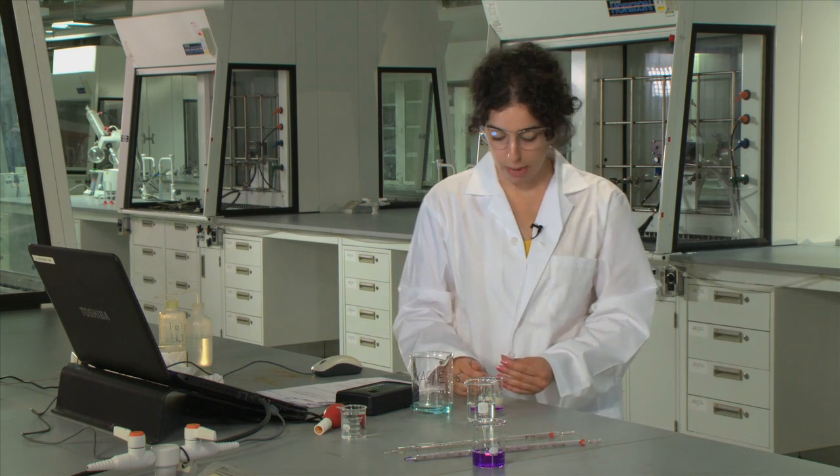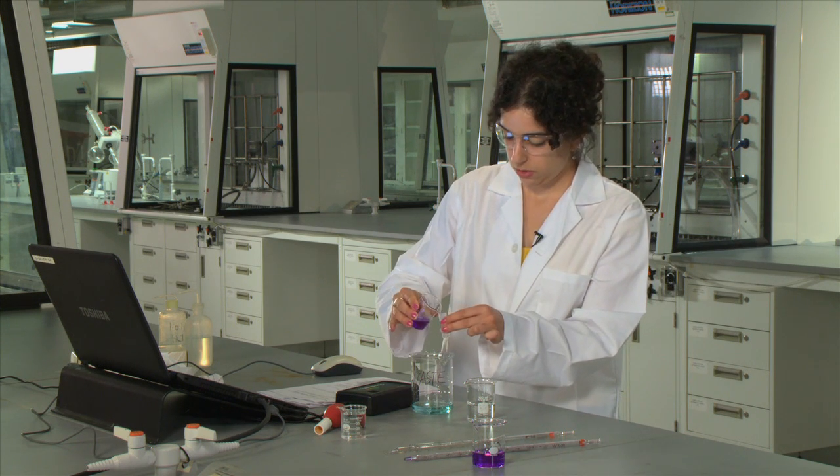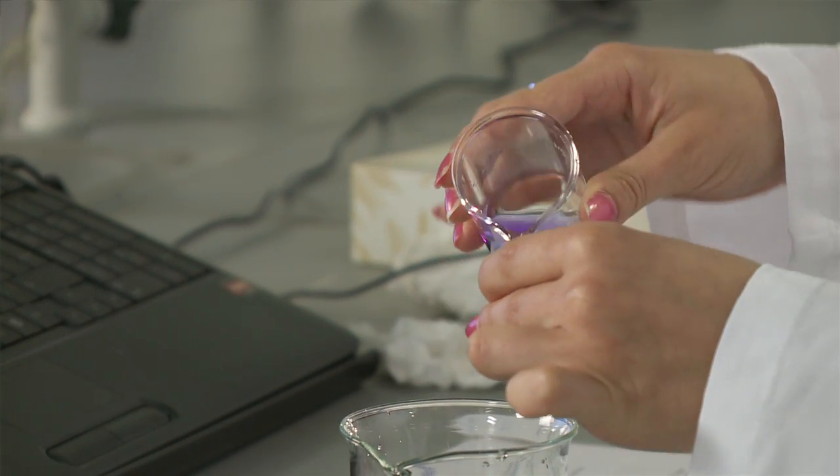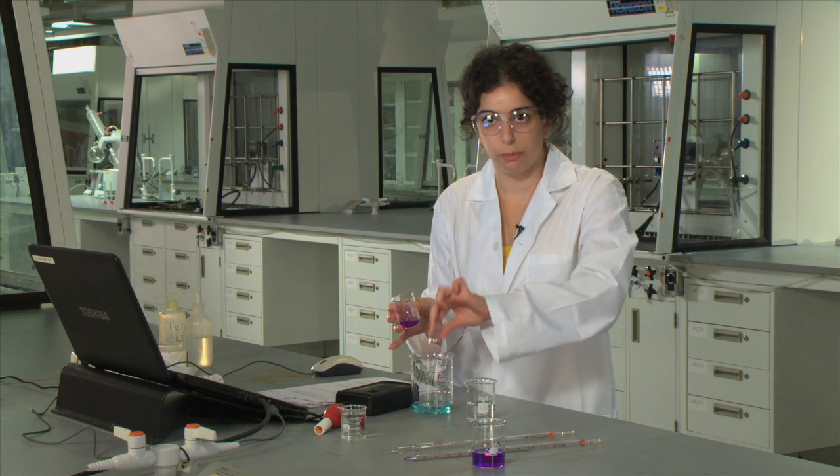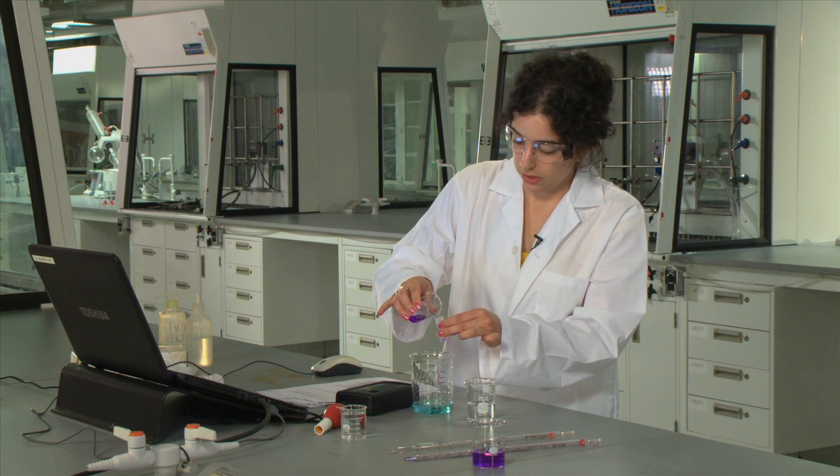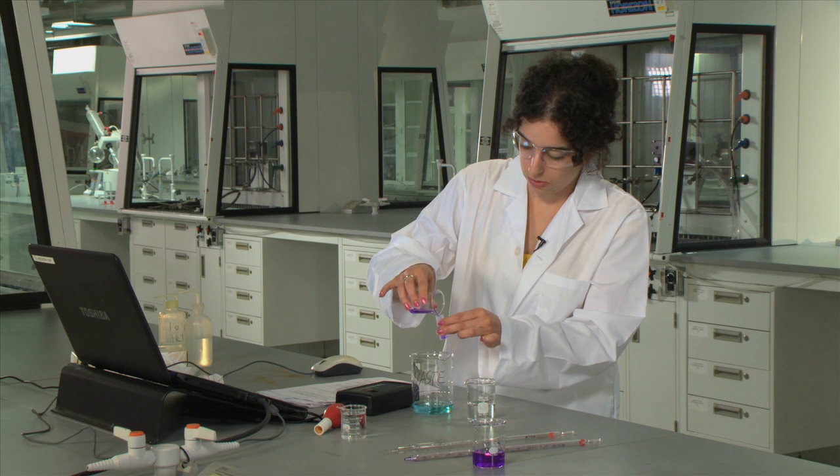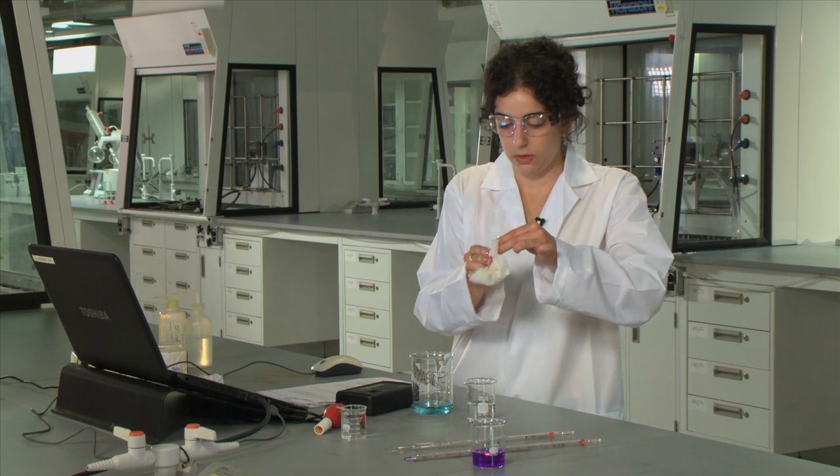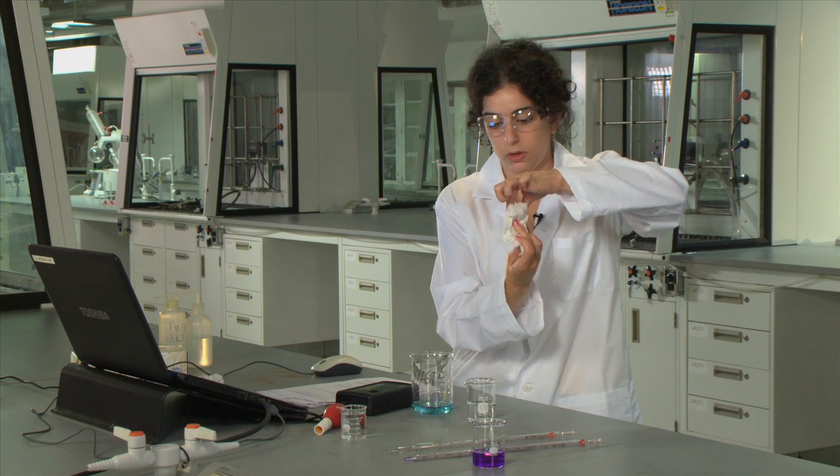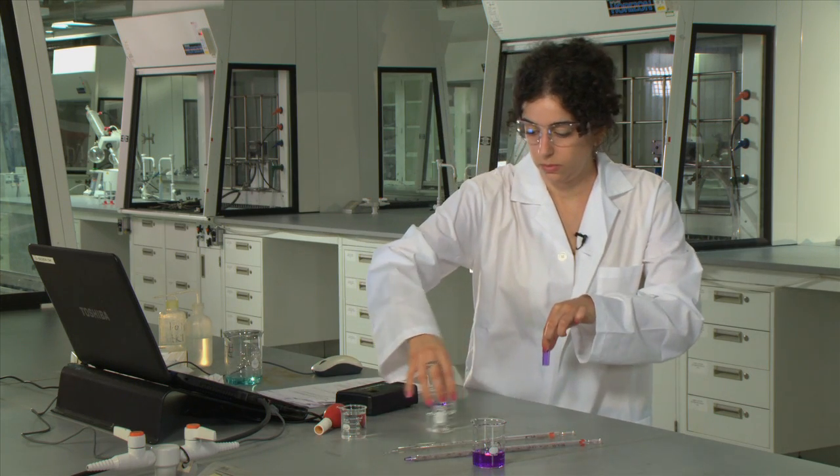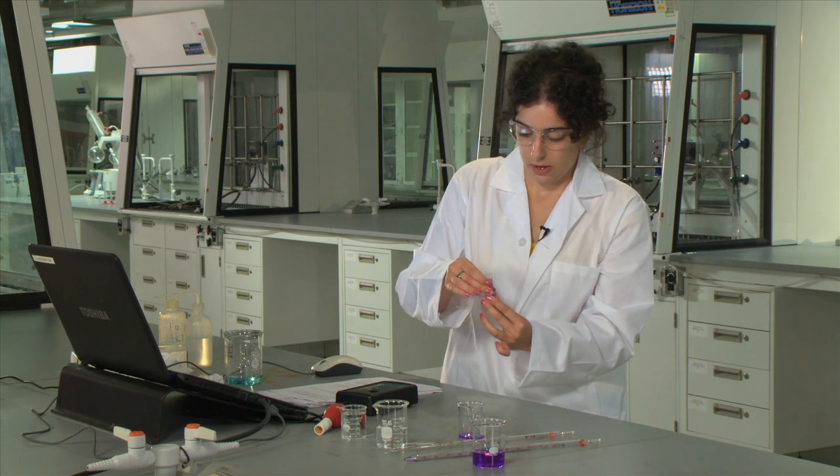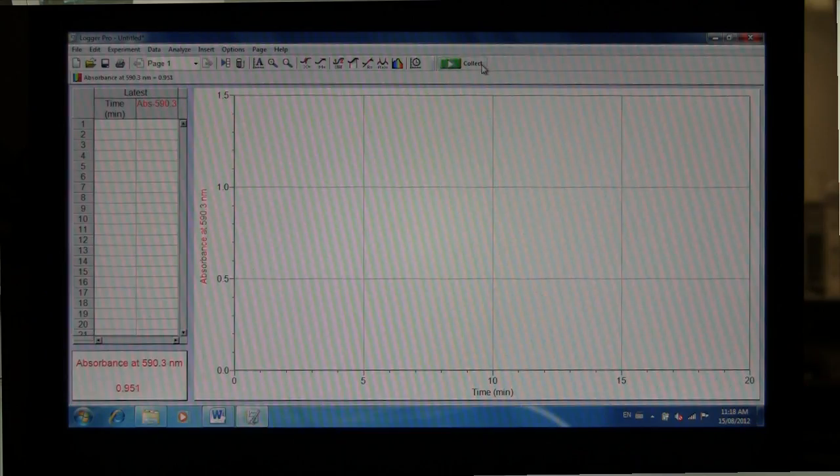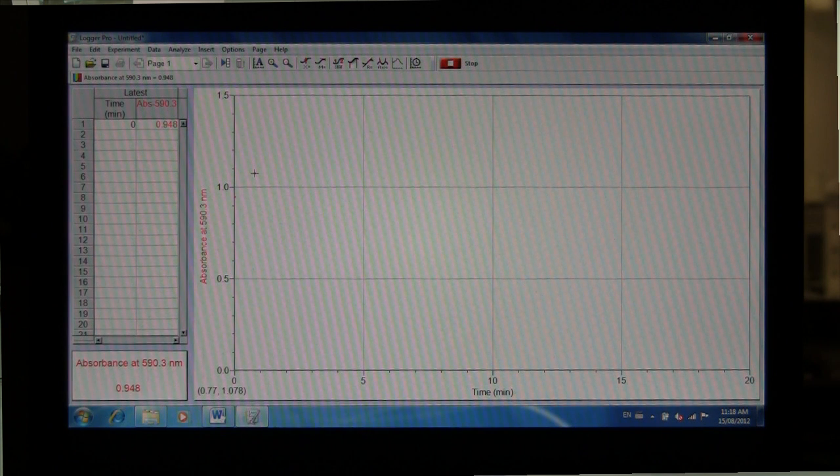And then once 30 seconds have passed, you're then going to add a little bit of the solution just to sort of wipe out any leftover solution from your previous measurements. And then fill up the cuvette, give it a quick wipe on the faces of the cuvette and place the cuvette in your spectrometer. On your LoggerPro software, you can then click Collect. And then your experiment will run for 20 minutes.